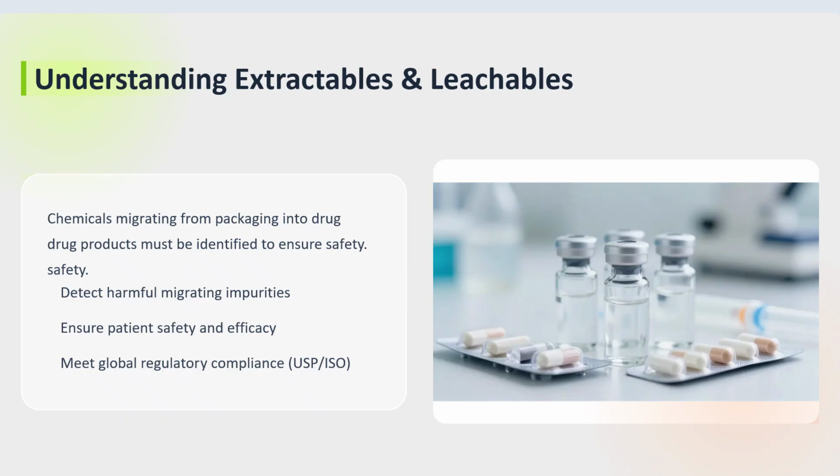First, let's quickly understand the difference between extractables and leachables. Extractables are compounds that can be pulled out from packaging materials under aggressive laboratory conditions, such as high temperatures or strong solvents. These studies help scientists understand the worst-case scenario.